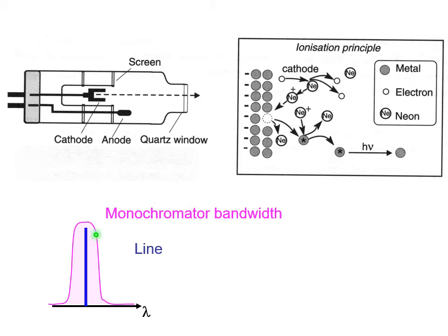It does not show us the real spectrum, but it works as a wavelength selector. So, to have specific wavelengths, we need two tools. One is the source, which will be a lamp specific to the element. And next, the monochromator.